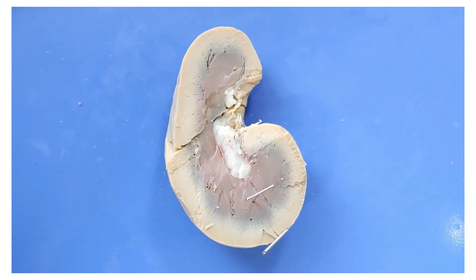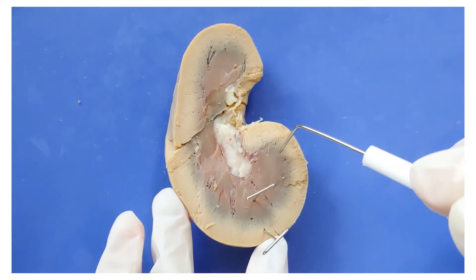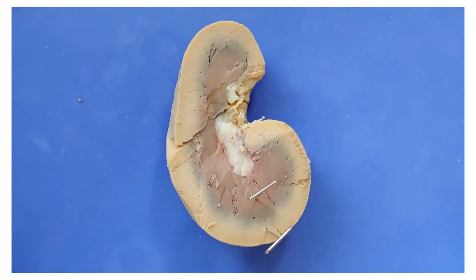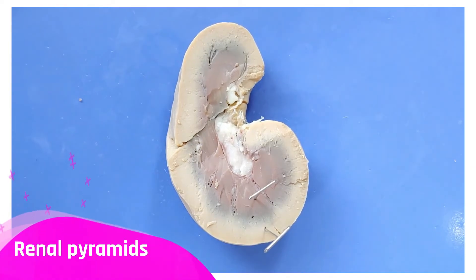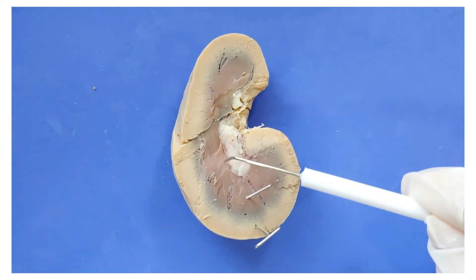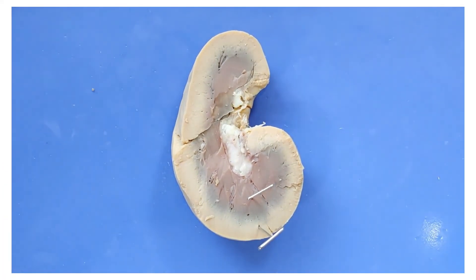You can also see that the medulla is divided into triangular structures. You can see one here — there's a triangle, here's another triangle, and here's a third one. These are called the renal pyramids. The white area in the center of the kidney is called the renal pelvis — not to be confused with the bone pelvis.